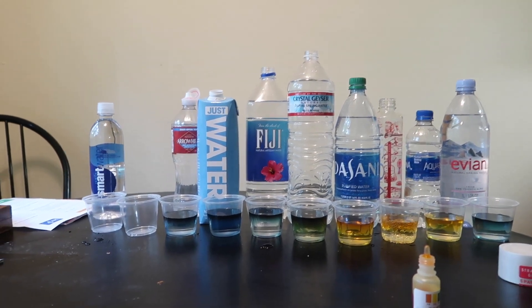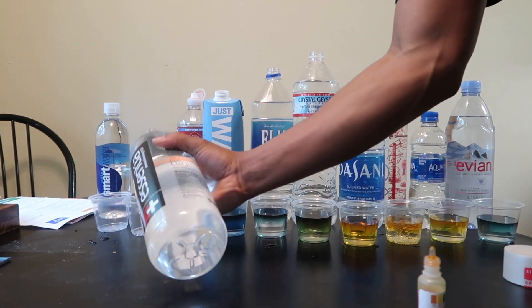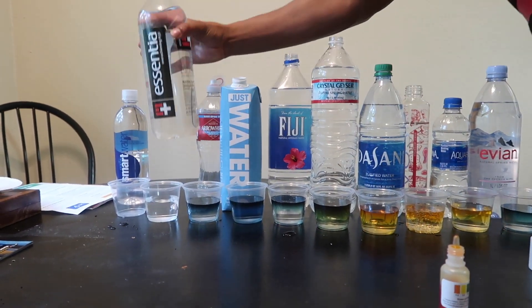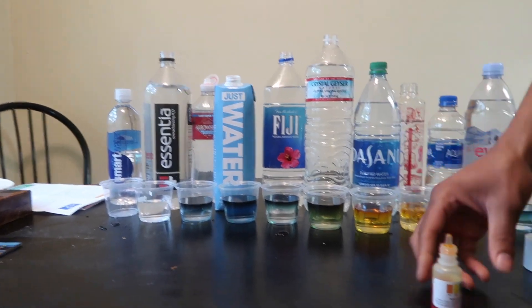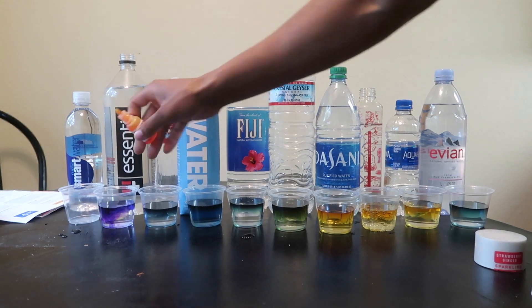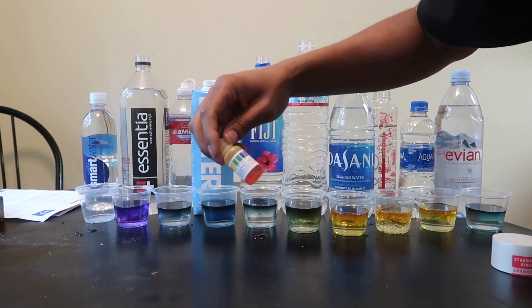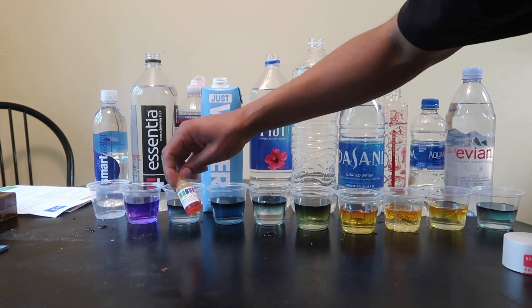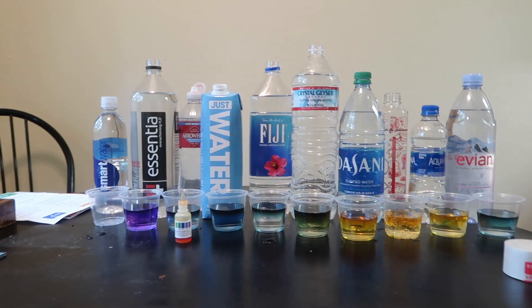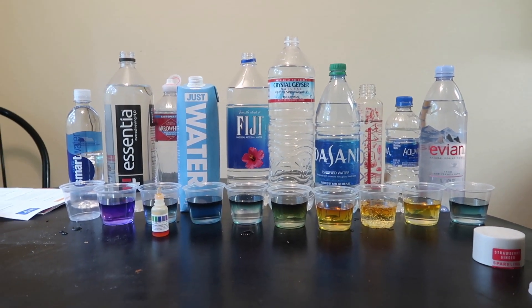Essential — whoa, oh that's purple! That's good, that's really healthy. That's like 8.0 to 9.0. Damn, I think that's the best one so far.